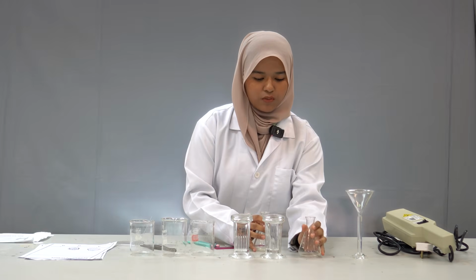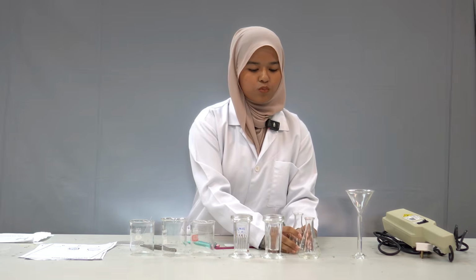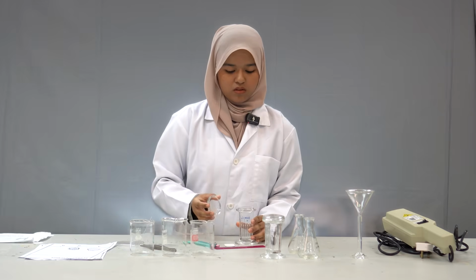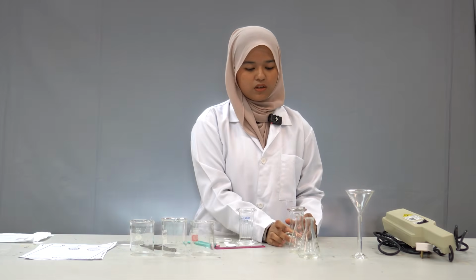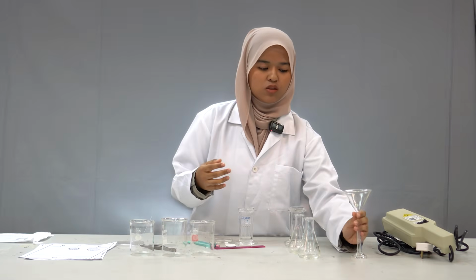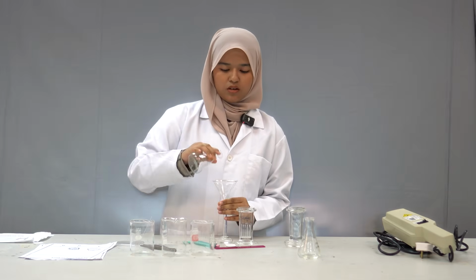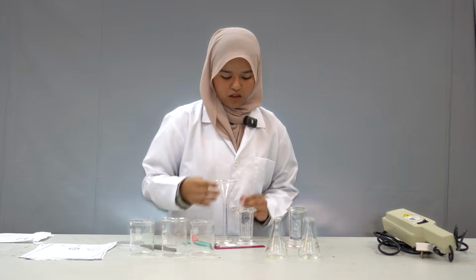After we have prepared our developing solvents, we need to put them into the developing chambers. These are two developing chambers for our different solvents. We use the measuring cylinder and the filter funnel, put the solvent in, and measure 5 ml.